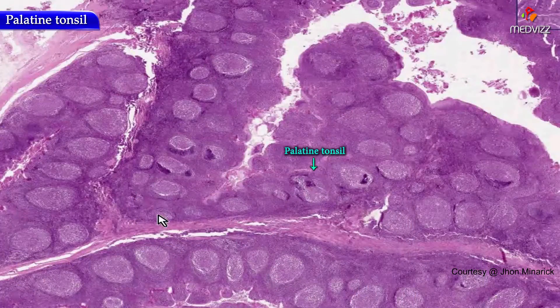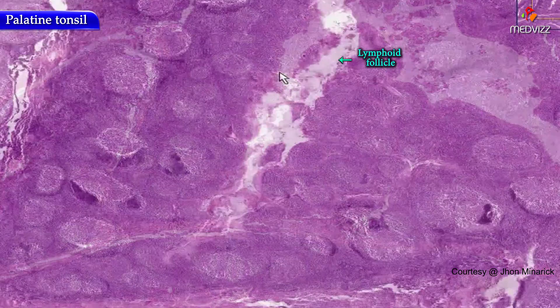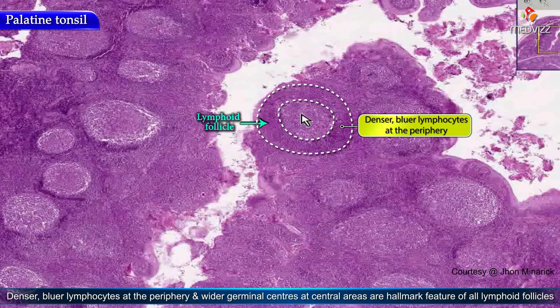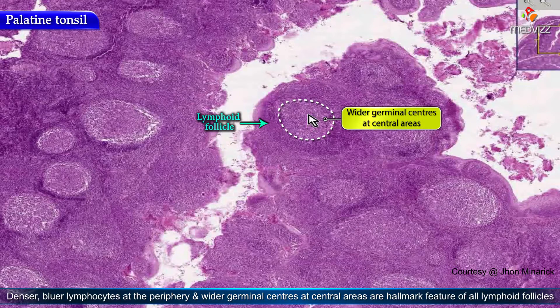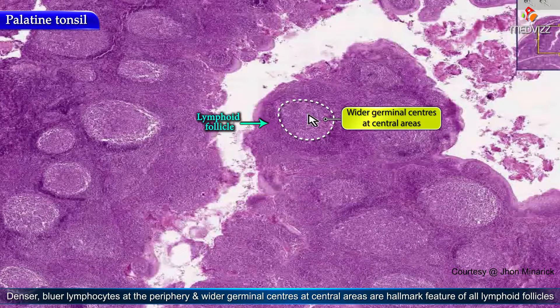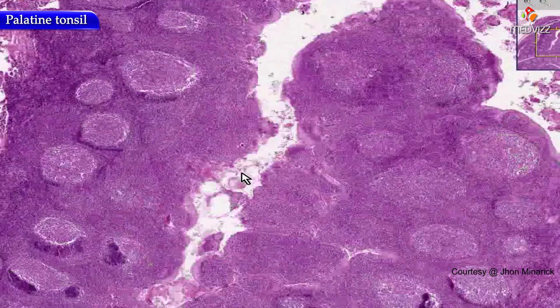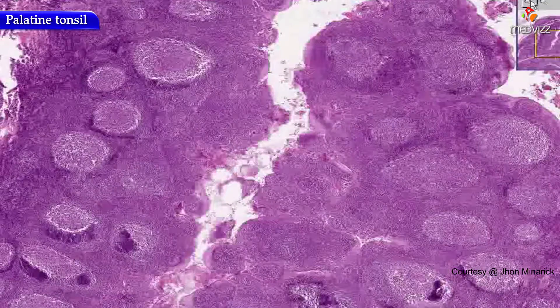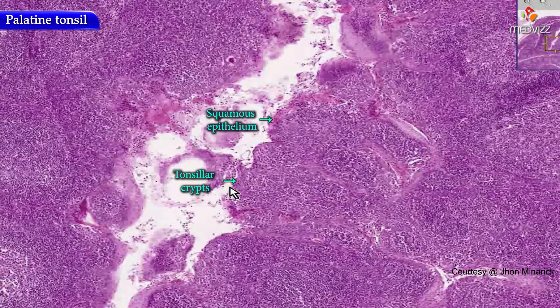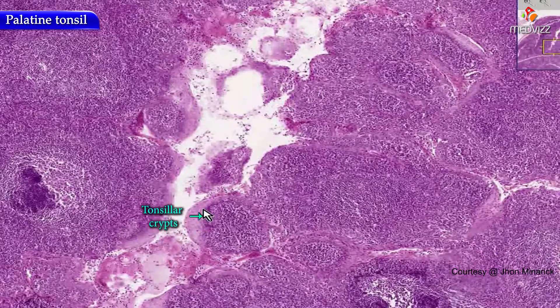This is a palatine tonsil. Of the three different types of tonsils, all contain lymphoid follicles in which the denser, bluer lymphocytes are at the periphery of a follicle and the lighter central areas are the germinal centers — the hallmark of all secondary lymphoid follicles or lymphoid nodules everywhere in the body. In palatine tonsils, you have the additional differentiation of squamous epithelium forming little clefts or crypts (C-R-Y-P-T-S) between these groups of lymphoid tissue, called tonsillar crypts.